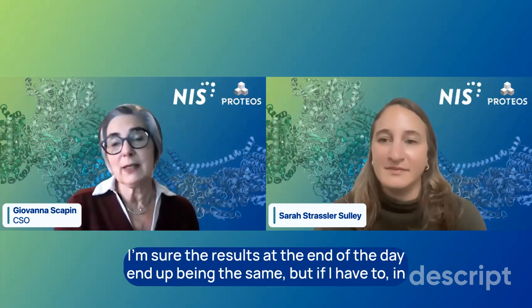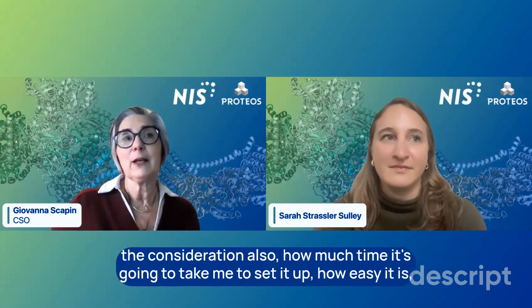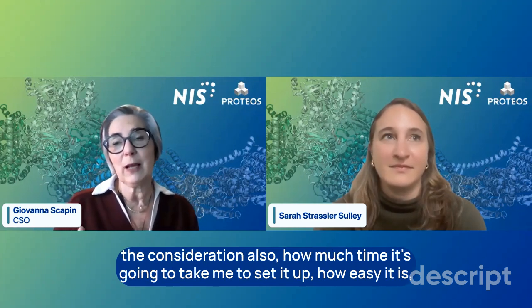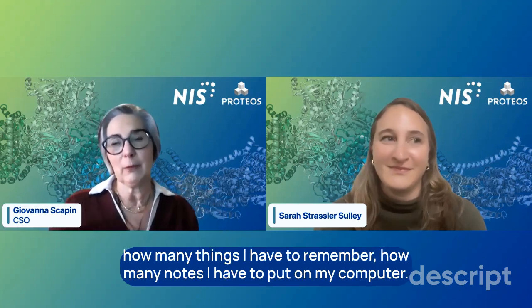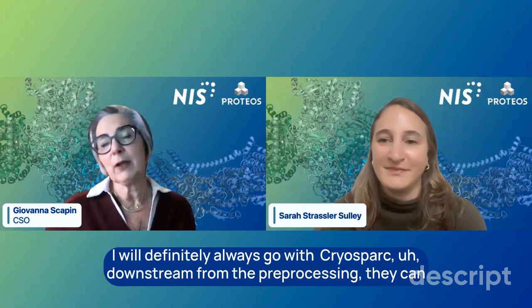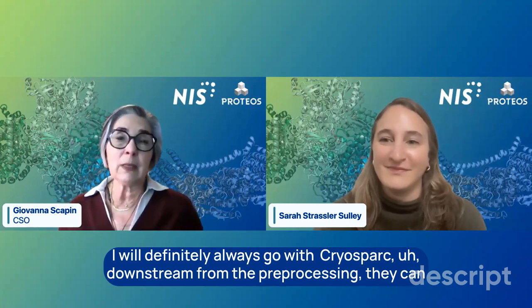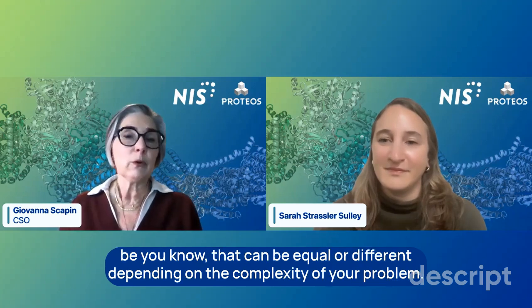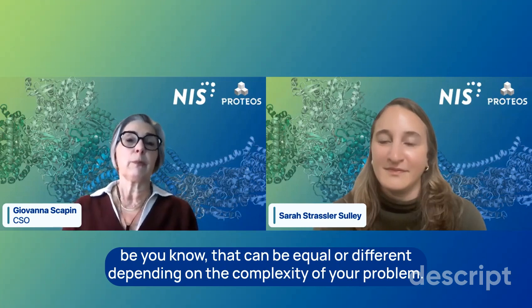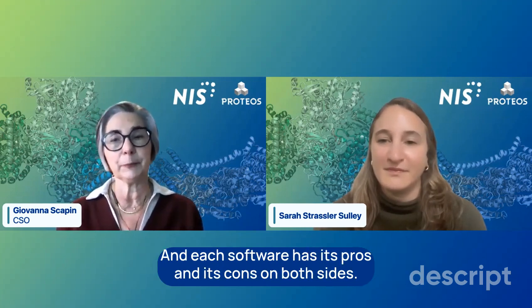It's not as user-friendly as CryoSparc is. I'm sure the results at the end of the day end up being the same. But if I have to consider how much time it's going to take me to set it up, how easy it is, how many things I have to remember, how many notes I have to put on my computer, I would definitely always go with CryoSparc. Downstream from the pre-processing, they can be equal or different depending on the complexity of your problem. And each software has its pros and its cons on both sides.